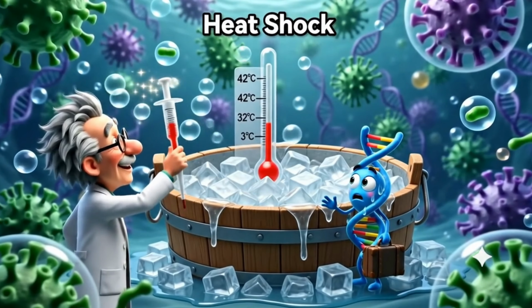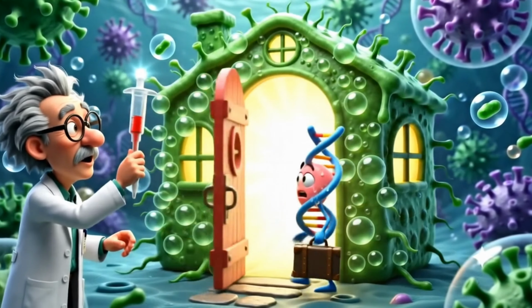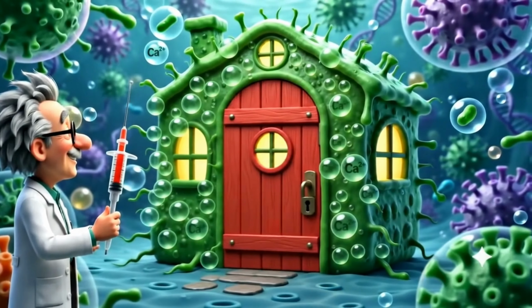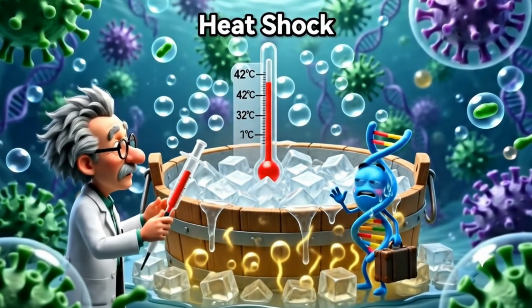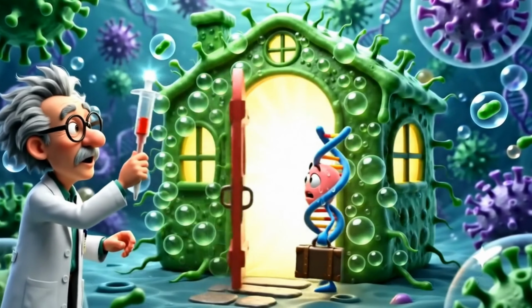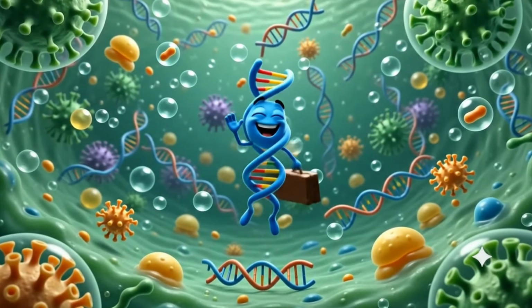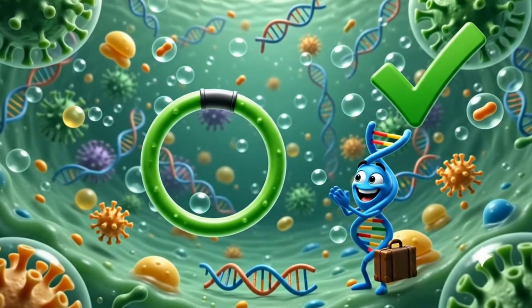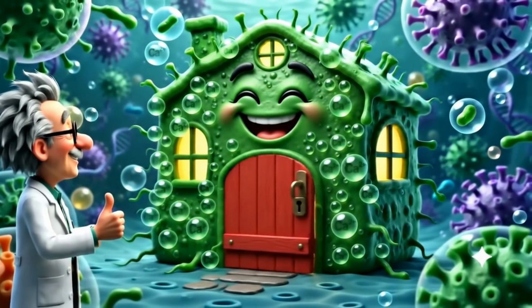Next comes the famous heat shock, where cells are briefly warmed to about 42 degrees Celsius. The sudden temperature change temporarily increases membrane permeability, allowing plasmid DNA to enter the cell. Congratulations! The bacterium is now successfully transformed with the new plasmid DNA.